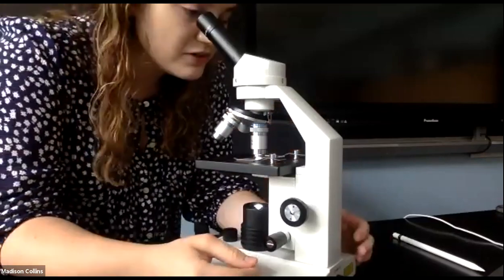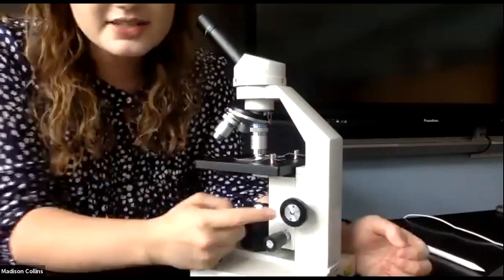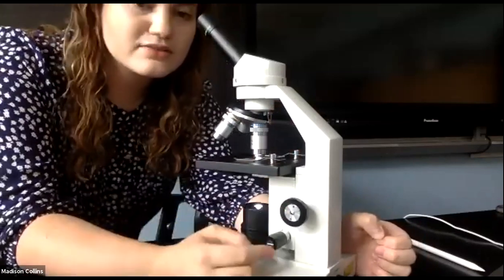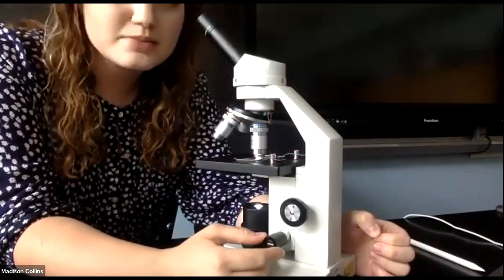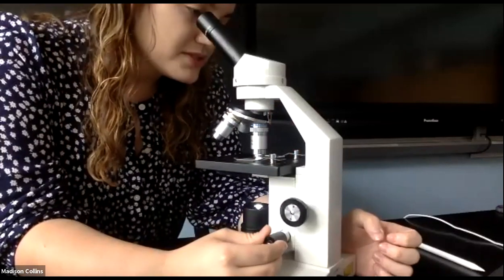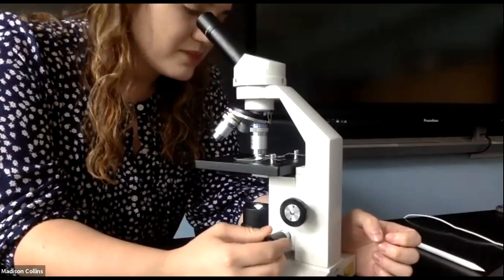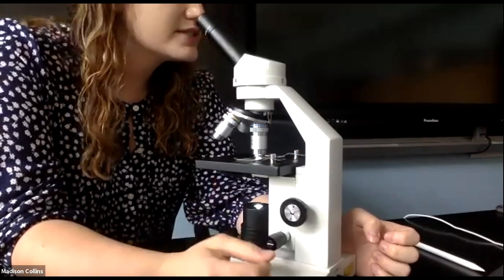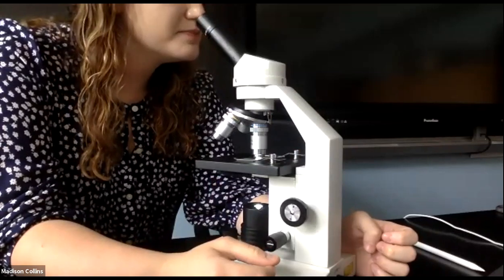So now, because I've already focused it, I don't need to touch that coarse adjustment anymore. If the edges are a little bit unclear and I need to see them more clearly, I can use this fine focus to see the details more clearly. Okay, so there is our focusing agents. What is next? Let's see.